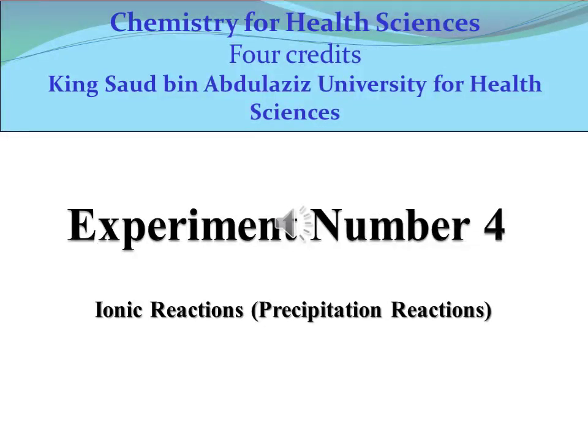Bismillahirrahmanirrahim. Experiment number 4: Ionic reactions and precipitation reactions. In this experiment, the student will react two ionic compounds in aqueous solution to observe the precipitation reactions.